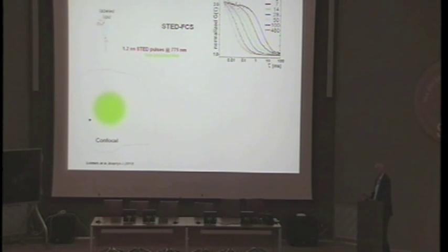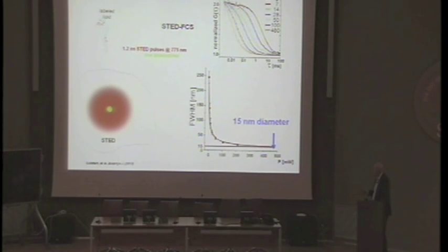Now, in confocal, people have done that extensively, no doubt. And this was important for many applications. But they have always been limited to measuring areas of that size, no way out. Here, we can make them much smaller so that we see details of diffusion from much smaller areas, down to about 15 nanometer resolution. So you can imagine a 15 nanometer spatial resolution of diffusion measurements in the plasma membrane of a cell. In this case, this was done with artificial bilayers, but in living cells we got down to about 20 nanometers. This is not the end. It's just to show you what can be done so far.